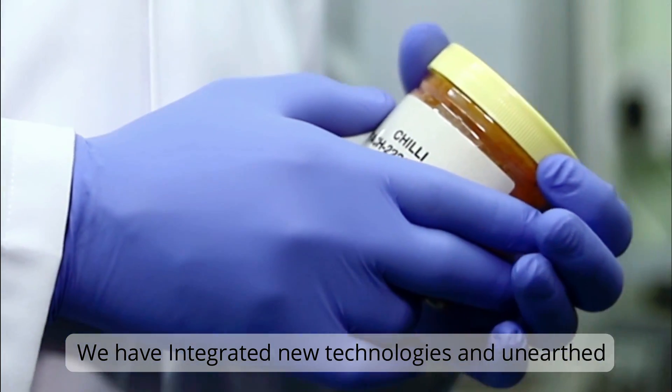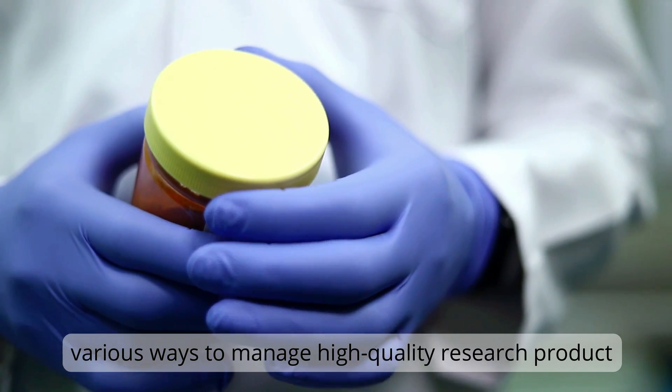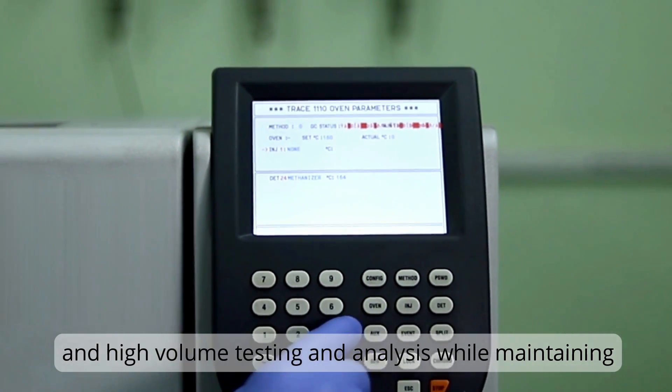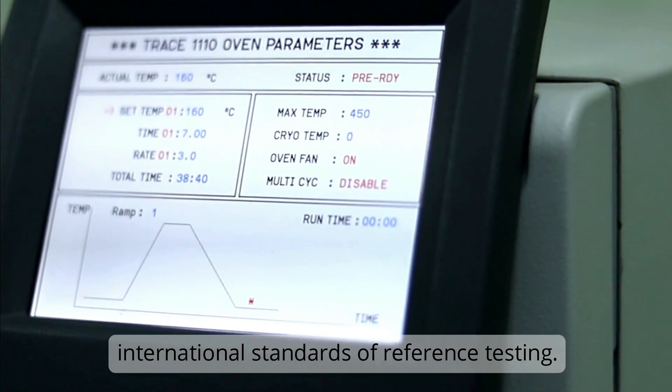We have integrated new technologies and unearthed various ways to manage high-quality research products and high-volume testing and analysis while maintaining international standards of reference testing.